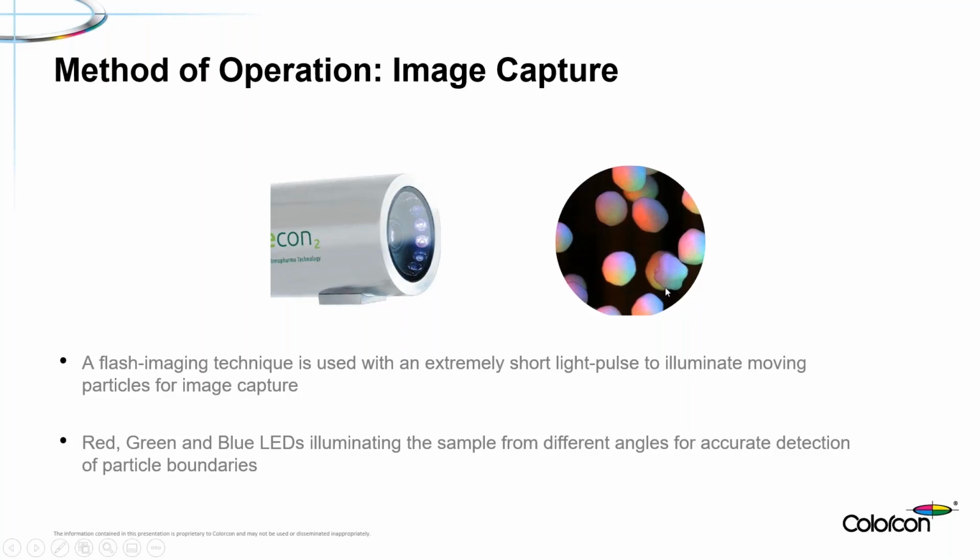So the difference in color and intensity allows the algorithm to pick out that this is one particle overlaying another one rather than simply one large particle. And I'm sure you can see the importance of it even here, but you can imagine when you're looking at a process like fluid bed granulation through a window, where it's essentially a tightly packed sheet of material on the other side of the window. It's very, very important to be able to tell the difference between small particles all packed together touching one another versus one giant particle or several very large agglomerates.